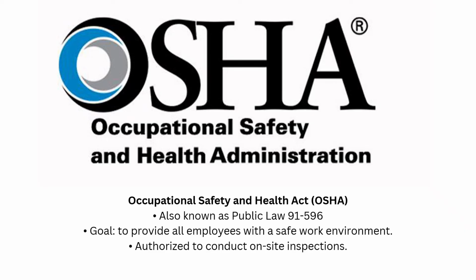The Public Law 91-596, or better known as the Occupational Safety and Health Act, was enacted by the U.S. Congress in 1970. The main goal of this federal regulation is to provide all the employees, clinical laboratory personnel included, with a safe work environment.